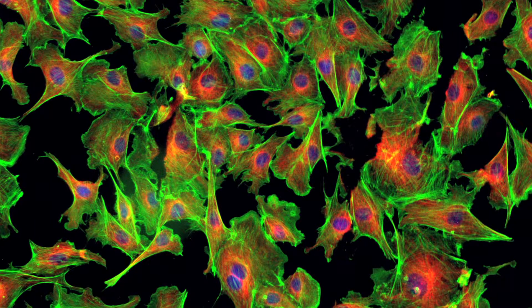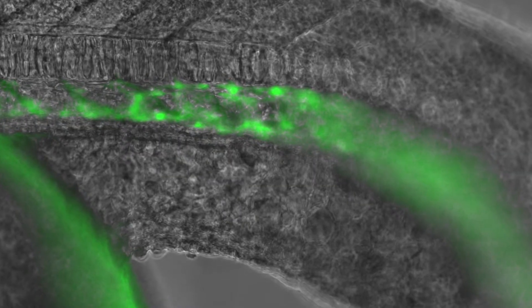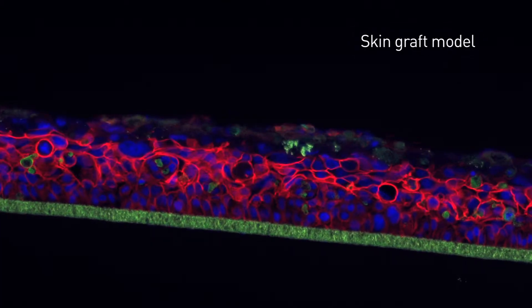With Floyd we have a single objective with fixed optical filters in place, which means no frustrating aspects of filters being moved without your knowledge — and it's also very durable and super robust. We also put high-quality components in there, including a high-quality 20x objective, and even the most advanced microscopists have commented on the excellent images they've captured on Floyd.